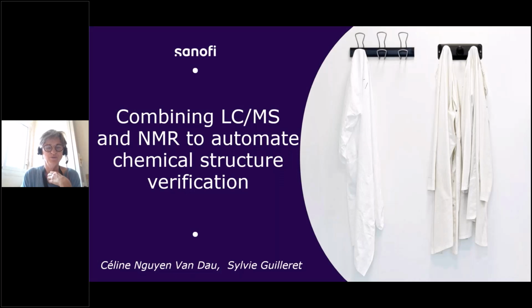So first of all, I would like to thank ACDLabs for giving me the opportunity to show you the project we are developing together regarding a system combining LCMS and NMR to automate chemical structure verification.